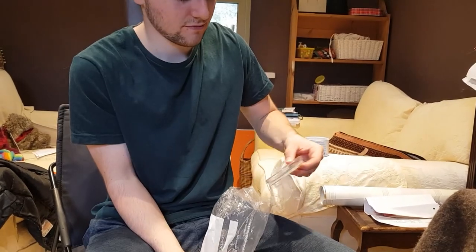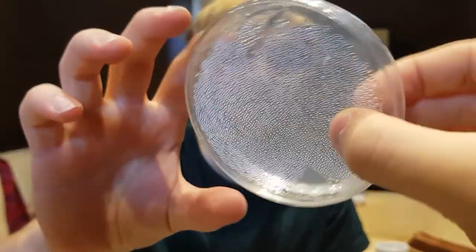Careful with that. The agar is on the top right now. Oh, right. So you're going to turn it upside down, place it, and then put it back the other way so that bacteria can't fall onto it. Just get a good range.